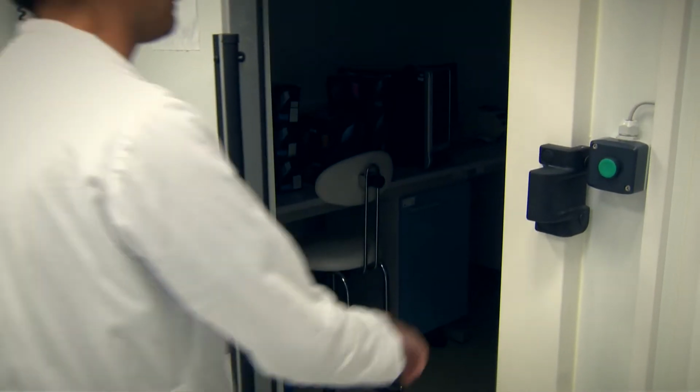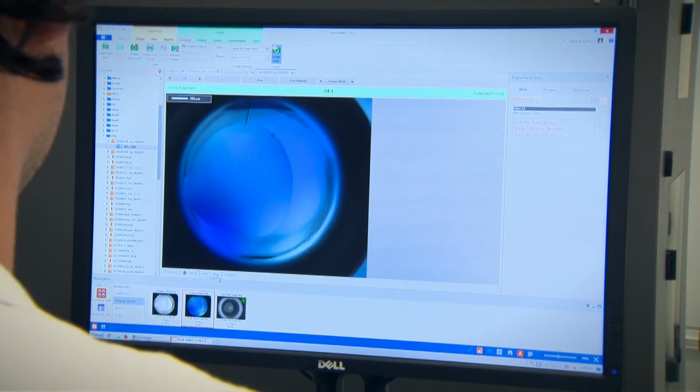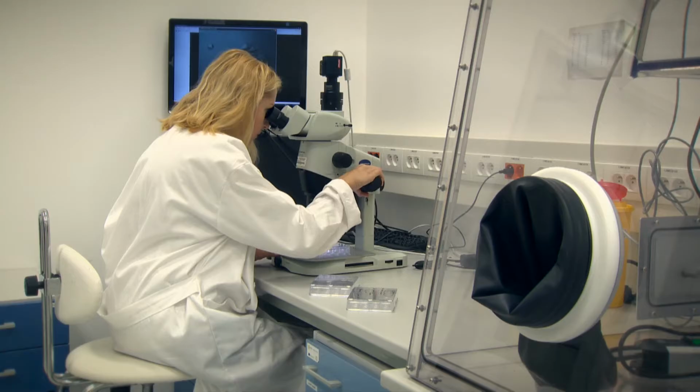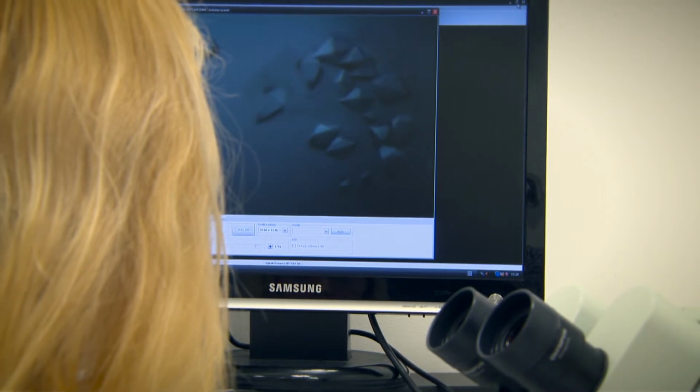One of the most complex methods we use is crystallography, which determines an accurate arrangement of atoms in biomolecular structures. The first step in determination of a molecular structure is crystallization. In case of biomolecules, it is a complicated and time-consuming process which takes weeks or even months.